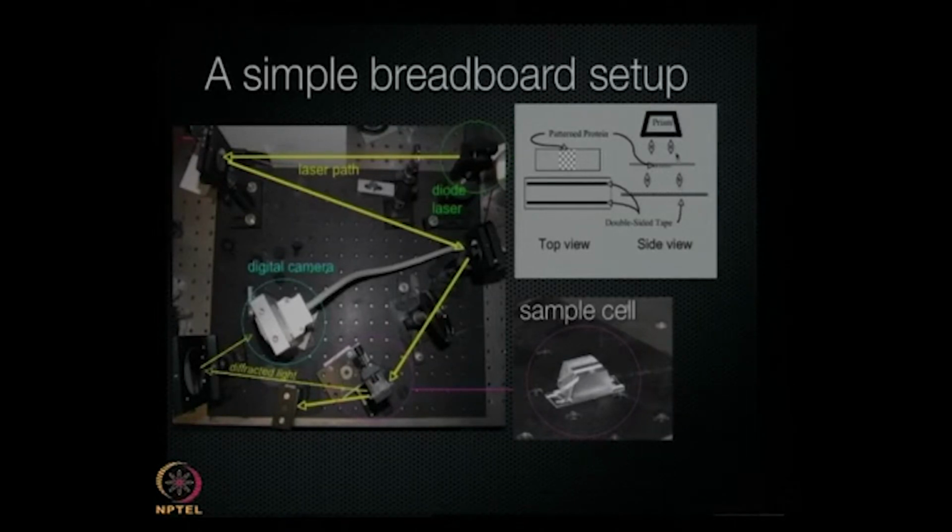Right. And on the other side, we put in a prism. The prism helps to guide the light so that we're under what's called total internal reflection. So the light doesn't go all the way through, it just skims the surface and actually detects the binding on this upper substrate. So it's very simple. So when you have a prism, you have the matching fluid for refractive index correction. Then you have the slides which contain the protein. That's right. And then with the light beam, you are initiating diffraction. Yeah, and with this simple assembly, you can actually measure down to nanograms per milliliter, label-free.